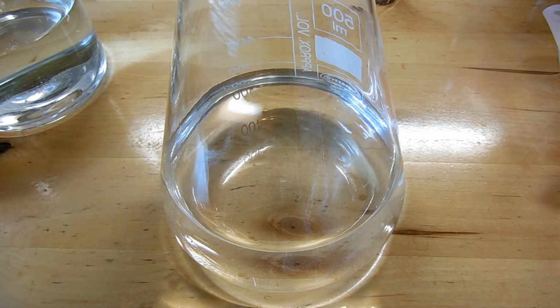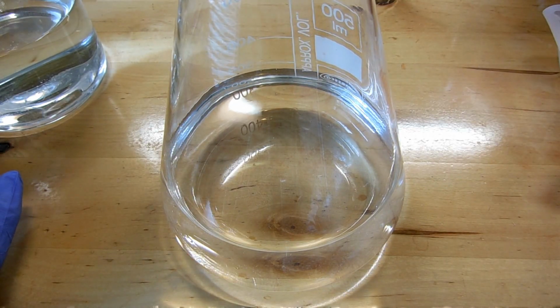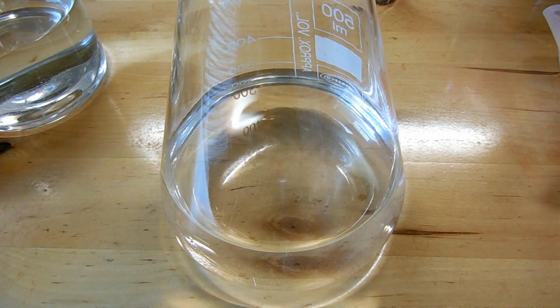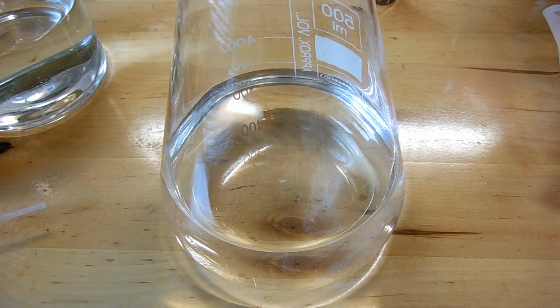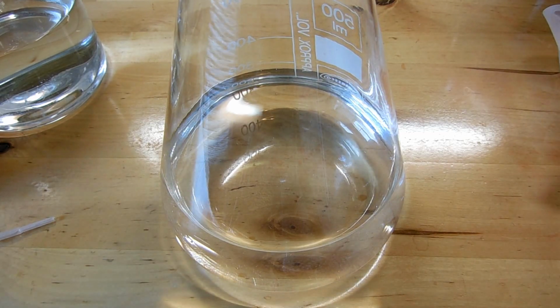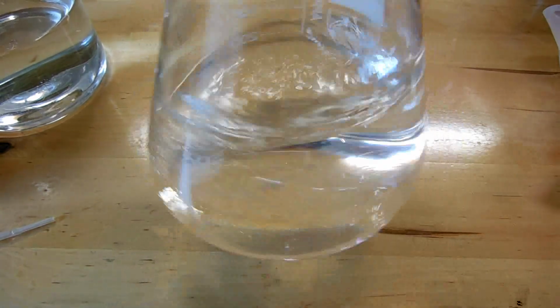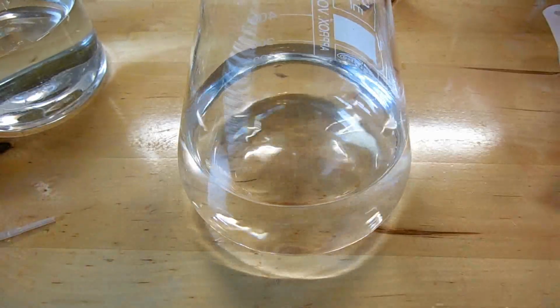So in the lead nitrate solution, there's a tiny, tiny amount of white powder that doesn't look like it wants to dissolve. So what we're going to do to hopefully fix that is acidify it with a drop of nitric acid. The reason this happens is that lead salts, lead nitrate at least, hydrolyzes in water. So it reacts with water and forms a hydroxide that drops out and is not soluble. So we want to try to prevent that and keep it in solution. So acidifying will hopefully help prevent that.